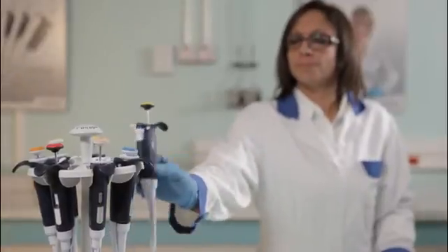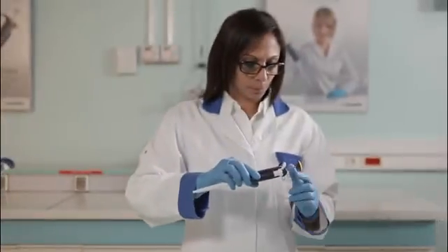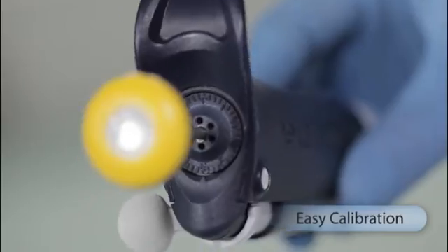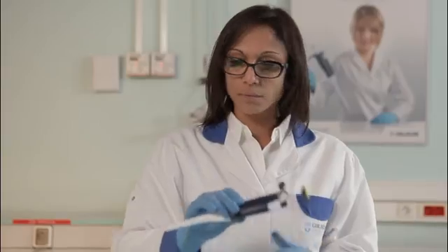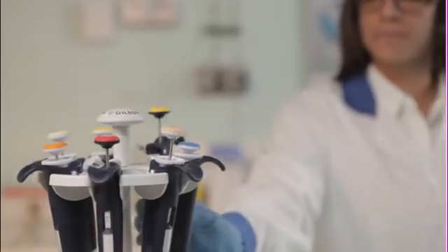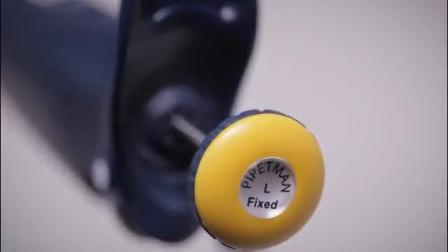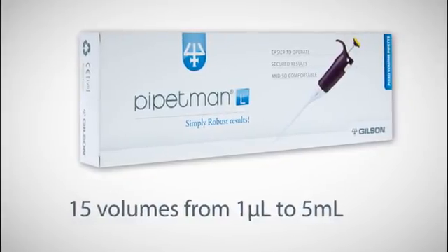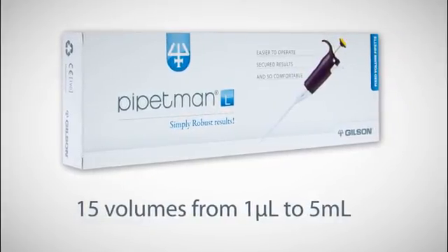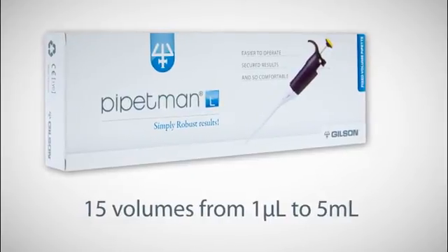Take advantage of the comfort of the PipetMan L with fixed volume pipettes. For specific liquids, the PipetMan L fixed can be readjusted from its graduated cover to perform the same accuracy. The PipetMan L is available in fifteen fixed models, covering a range of volume from one microliter to five milliliters.